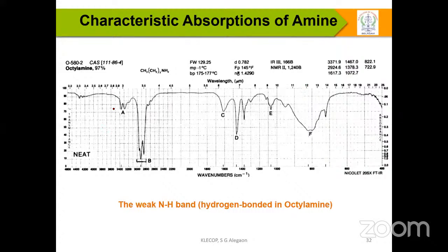Can you observe here? These are the amine peaks. A person who understands only theoretically can bias you, but practically it is not in that condition. Whatever I'm discussing today is all about the practical segment, not the theoretical.